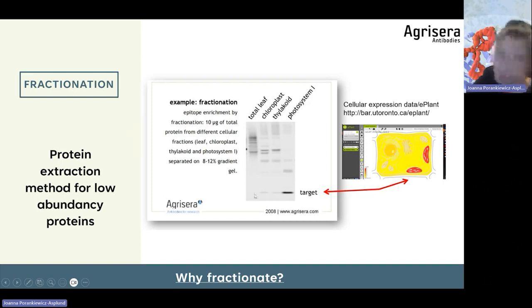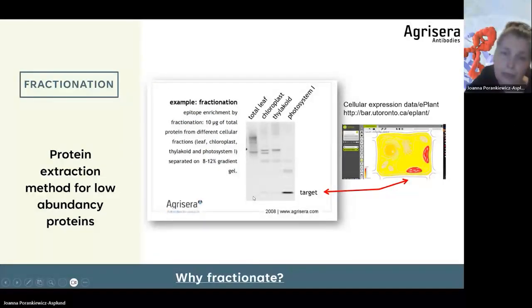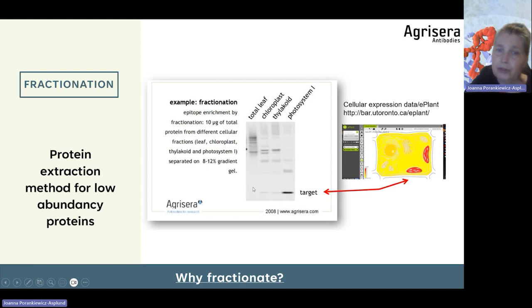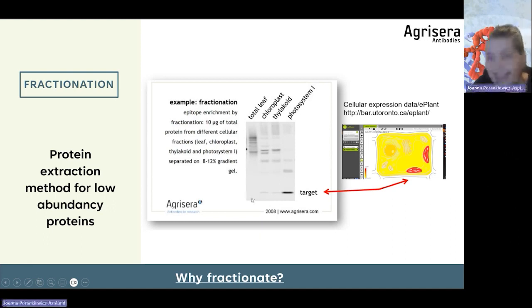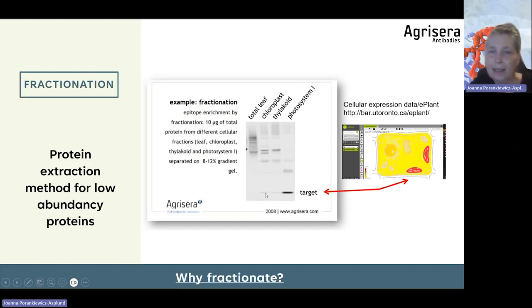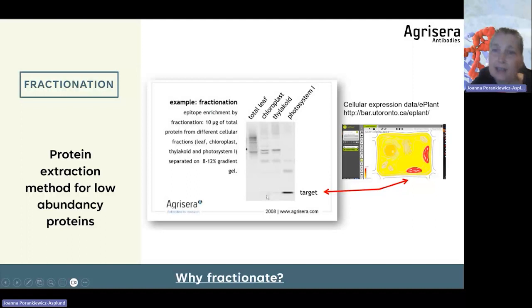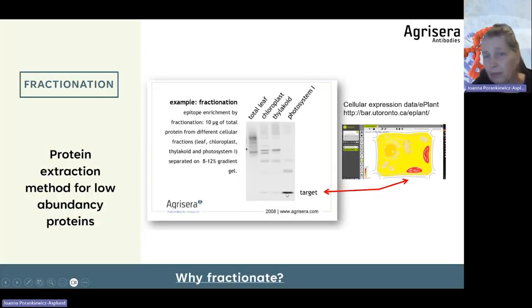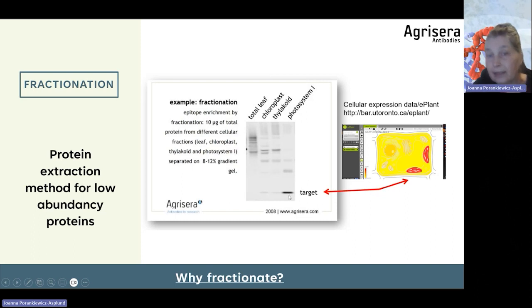As you can see in this example, there was absolutely no signal in total leaf extract. While when analyzing specific fractions — in this case the target was present in photosystem one — the photosystem one fraction gave the best signal.